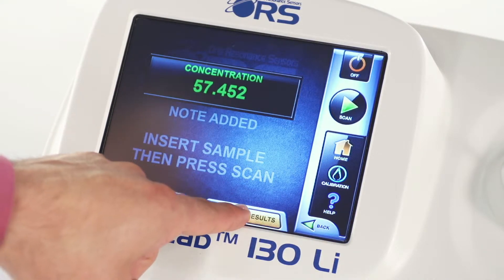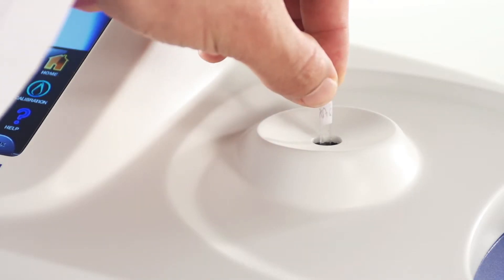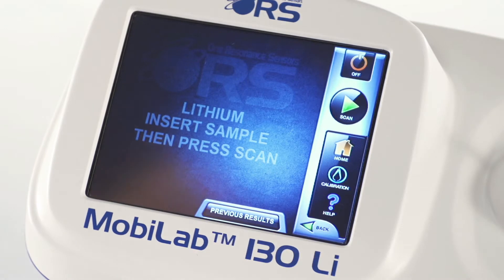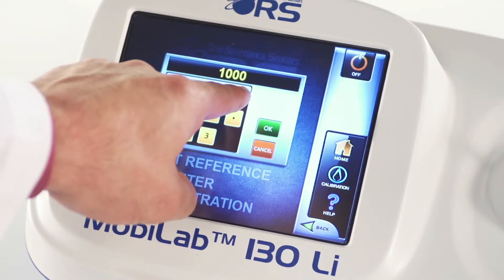Enter additional notes to conveniently keep files about testing history and results. If needed, perform a fast single point calibration. To do so, insert a reference sample and press the calibration button to the right of the touch screen display. A numerical keyboard will appear, allowing the user to enter the calibration value of choice.